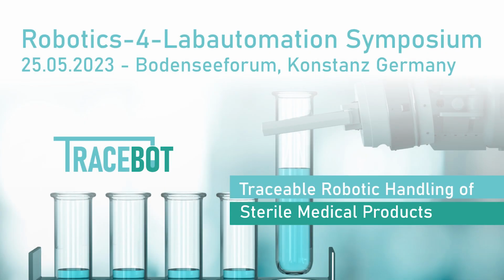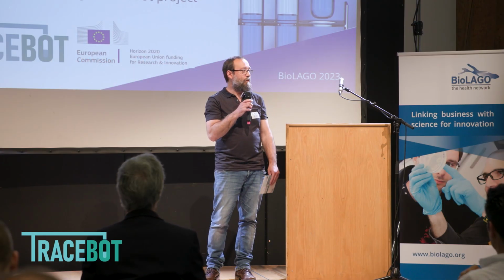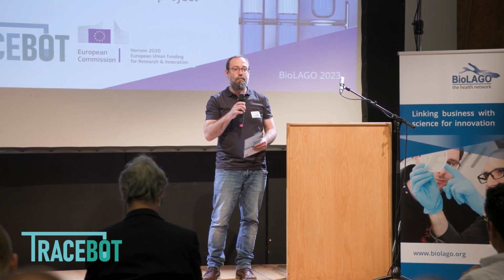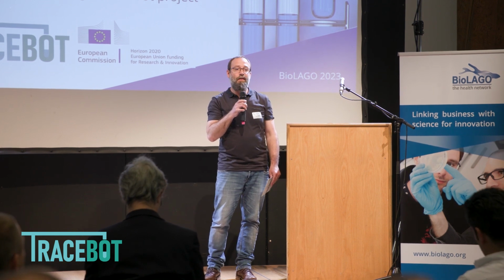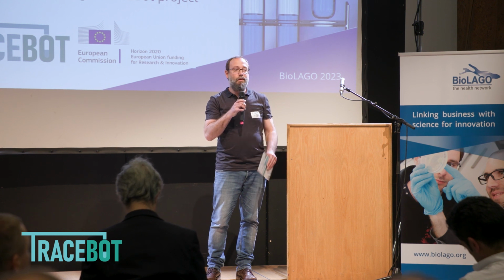And I'm pleased to welcome you to this event as a scientific and technical manager of TraceBot, this EU-funded project in which we are looking at a very critical process of the pharmaceutical domain, that is the sterility testing. And we are looking at it from a robotic perspective, looking towards its automation, and it raises many scientific and technical challenges that require gathering cutting-edge technology in robotics.